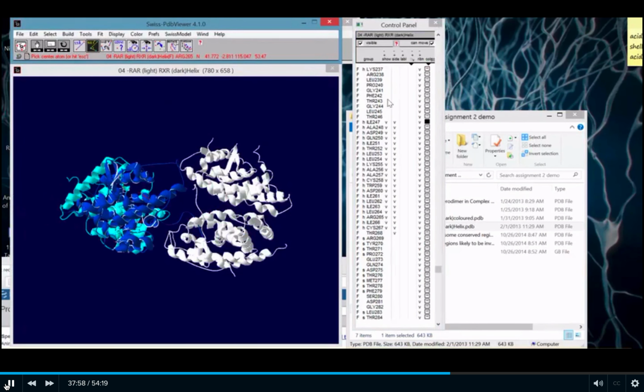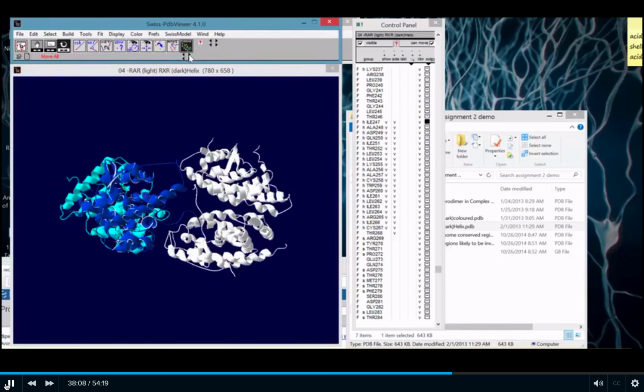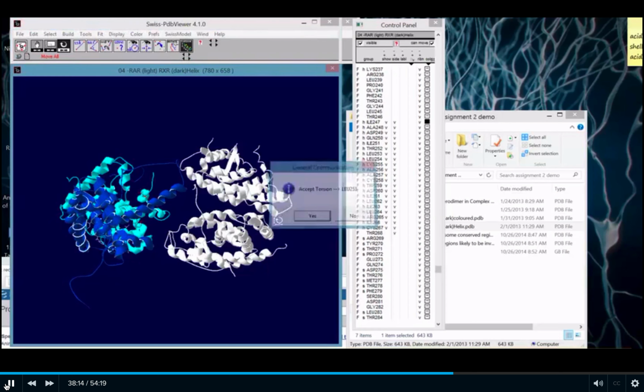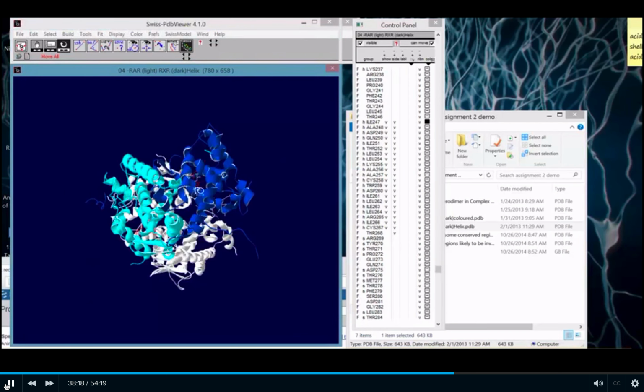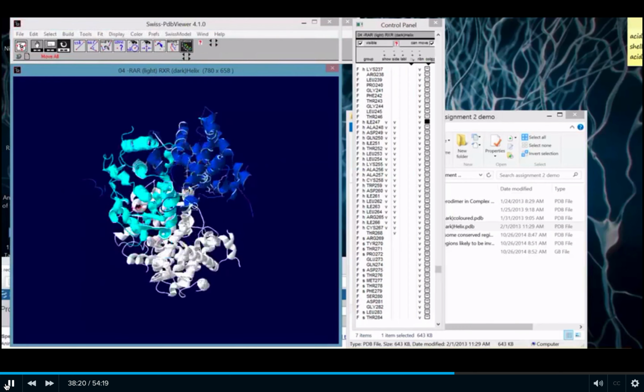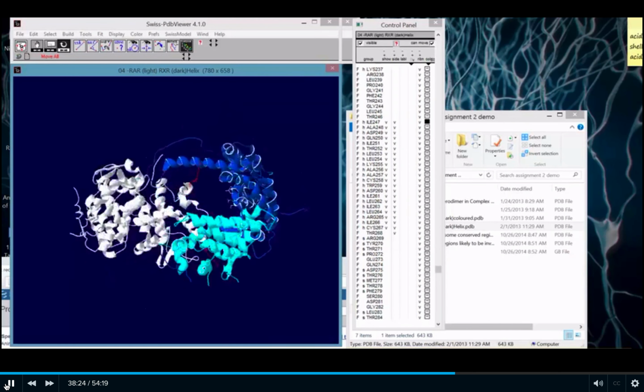If I was to show that again, I could see if I can click. It's a little tricky. But if I start to move this, look how the entire protein changes. You see that? Quite dramatic. So I can't propose anything under the sun, because if I did that, I'm probably going to have steric hindrance. If you look, this helix has completely collided with this protein. This loop region is physically overlapping with another helix here.